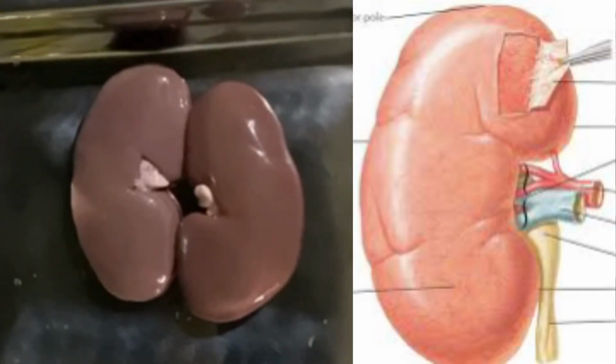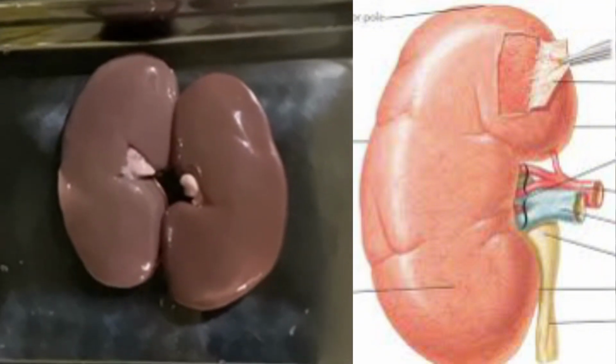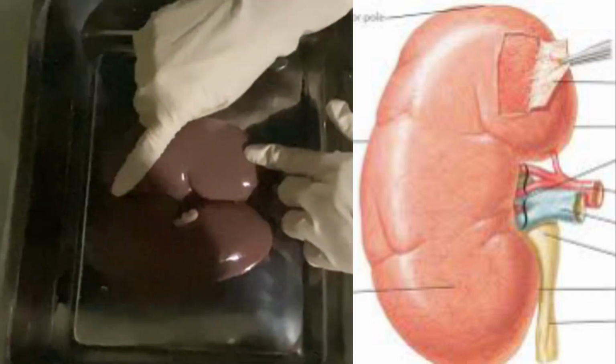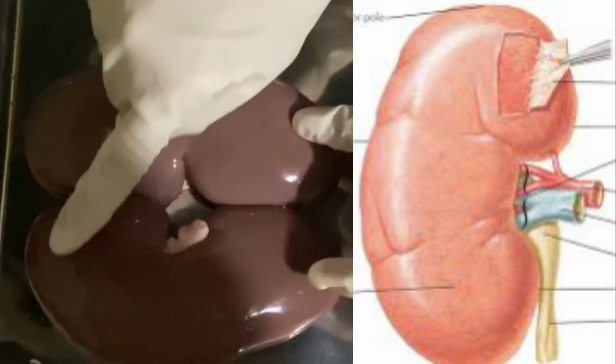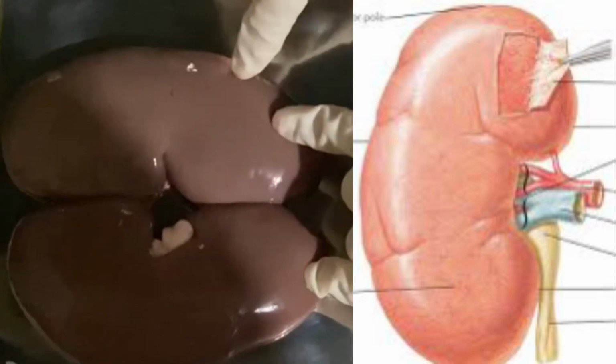The kidney is surrounded by the fibrous capsule, which provides support for the soft tissues inside. Unfortunately, the fibrous capsule is not seen in our kidney sample, so it is illustrated by the inserted image. But we should be able to easily locate it just outside the kidney's exterior.